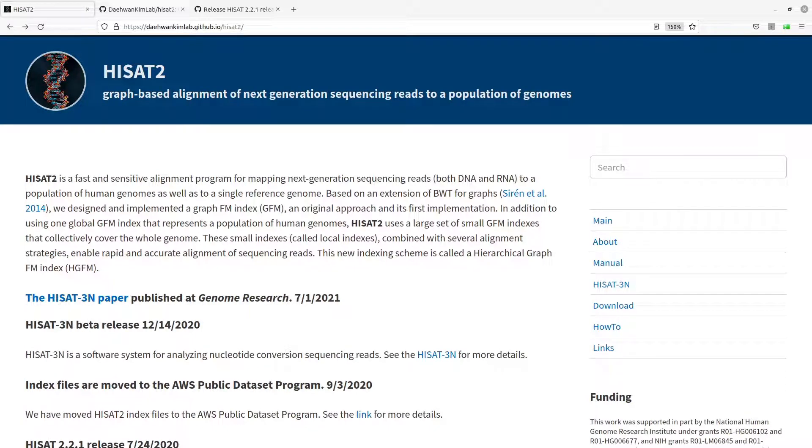Hi everyone, welcome once again to another tutorial session in Bioinformatics. In today's video, I am going to show you how you can install HISAT2 by building from source.